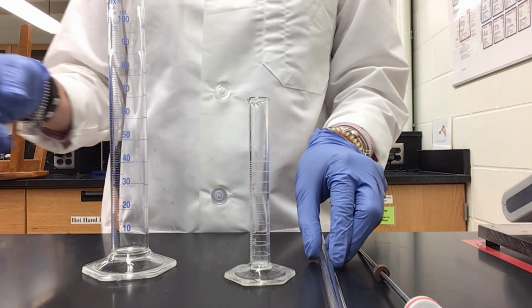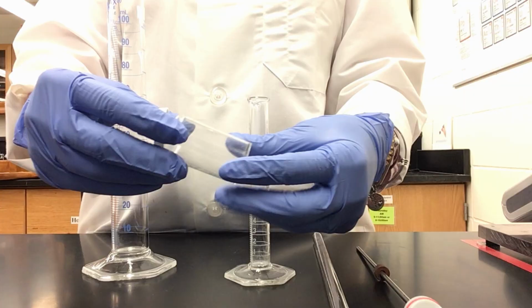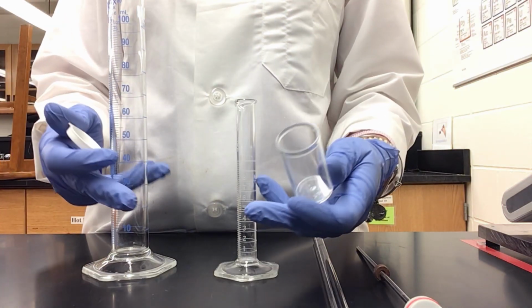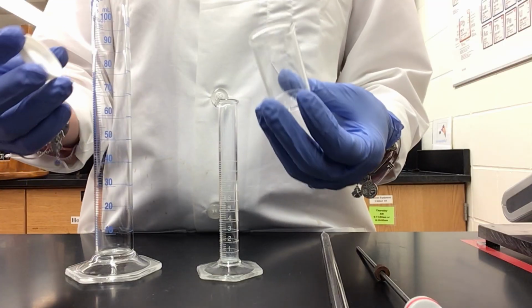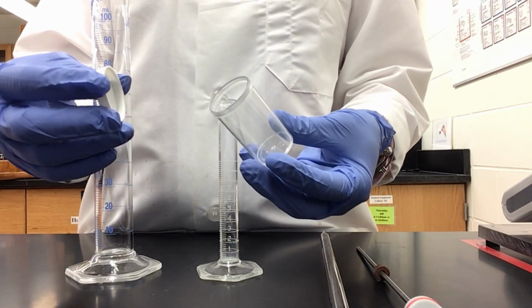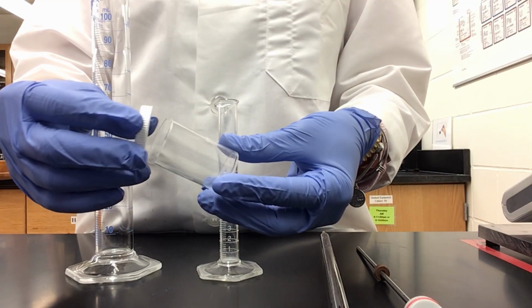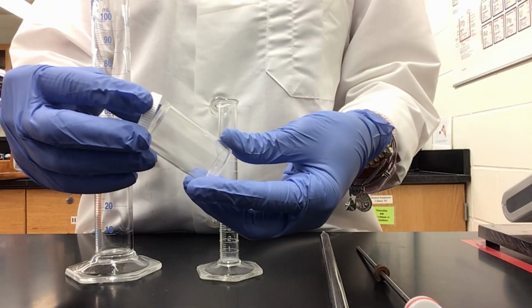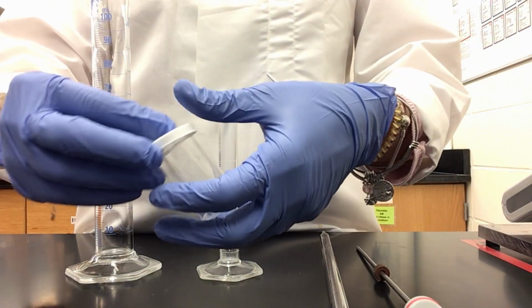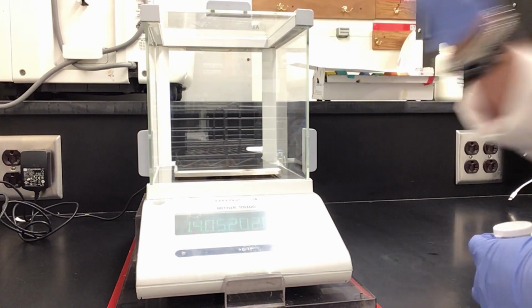Then we are going to measure the mass, the weight of the volume of those 10 milliliters of water using a plastic vial. So in order to do that, we need to mass the plastic vial itself. So we need the weight of the plastic vial. So that's what I'm going to do now. Now we are going to use the balance, the scale.